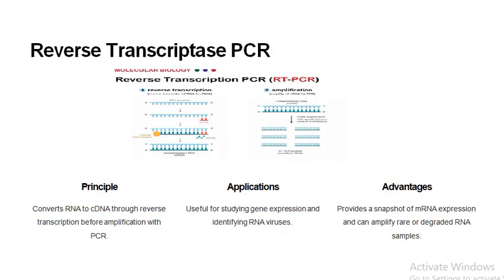After this we are going to learn about the second type of PCR, that is reverse transcription PCR, also called reverse transcriptase PCR, also called RT-PCR. The difference in RT-PCR is that we use a sample of RNA. Who has RNA?